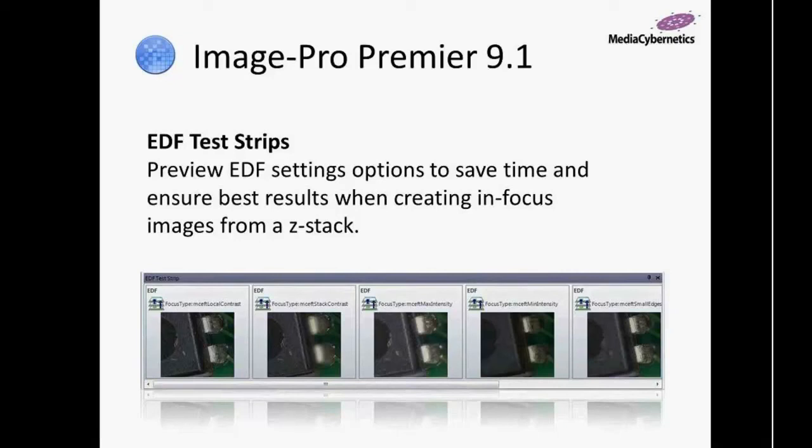to create the correct result. And this was actually in Image Pro Plus 7, and we made sure to reproduce this in our latest Image Pro Premier 9.1, and we've even improved it beyond what it was able to do before to make it a lot easier to figure out which is the best option.